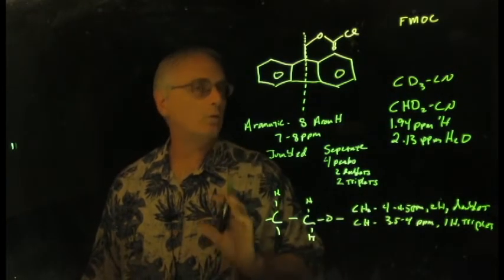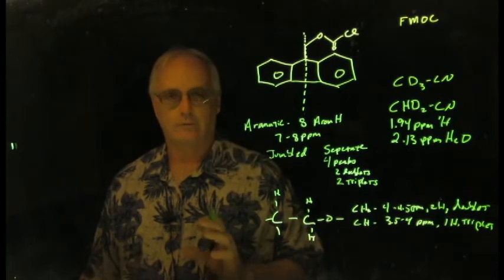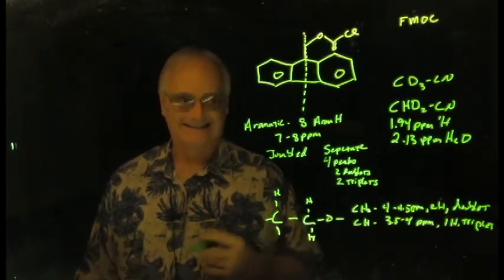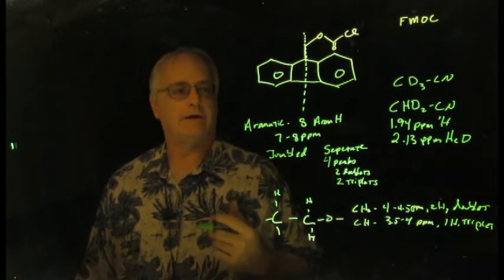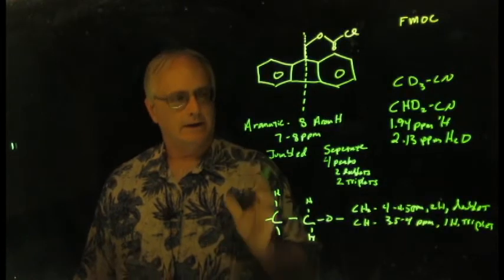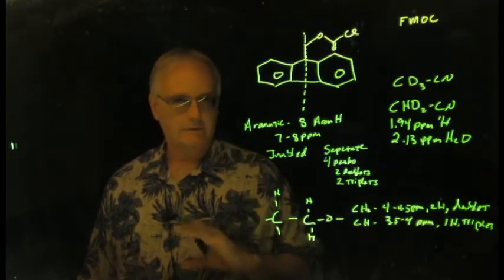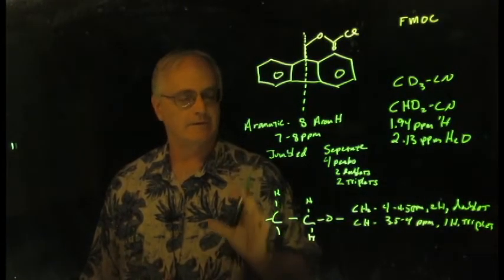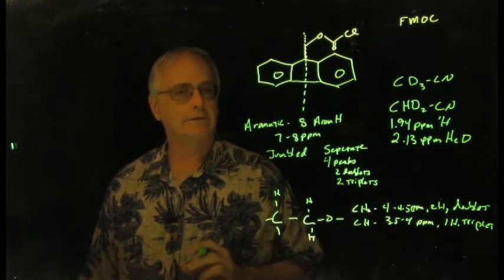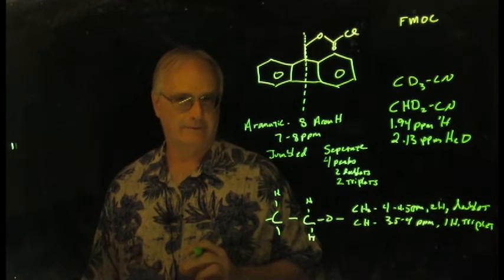There is, however, water. That's what I take away from this. Now, I'm 99% certain that this sample is FMOC. Everything matches up nicely. But as we talked about previously, if you can do so in a relatively small amount of time, it's not a bad idea, especially if a lot's riding on this kind of research, to also do the C13 spectra of this thing.